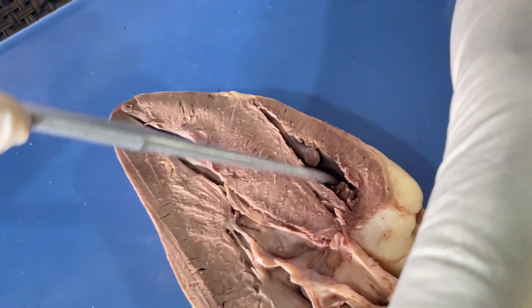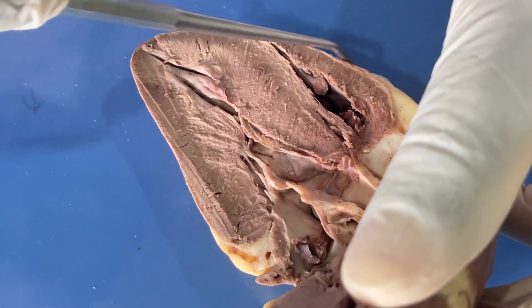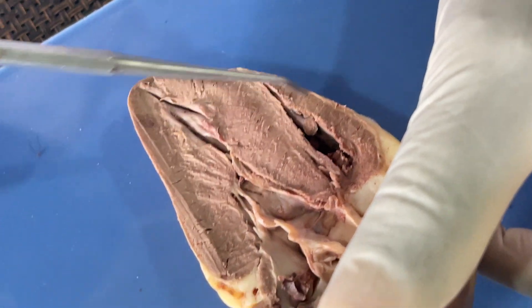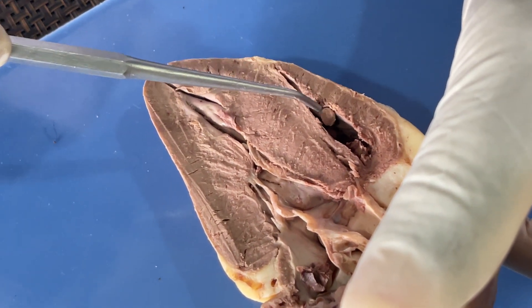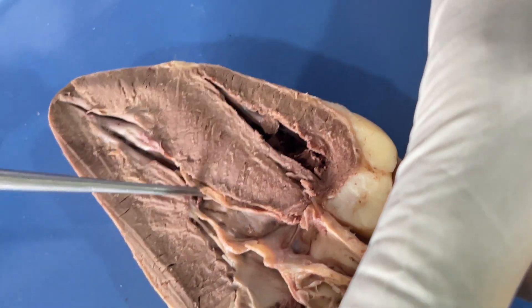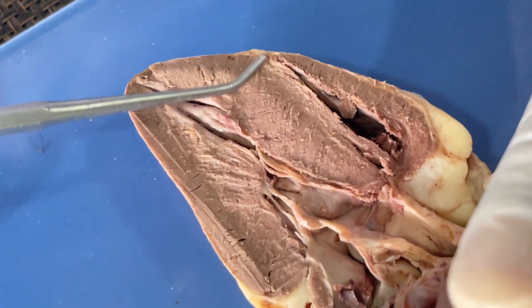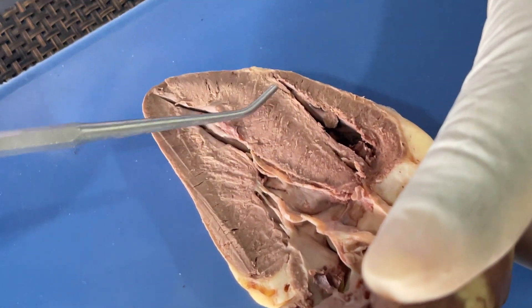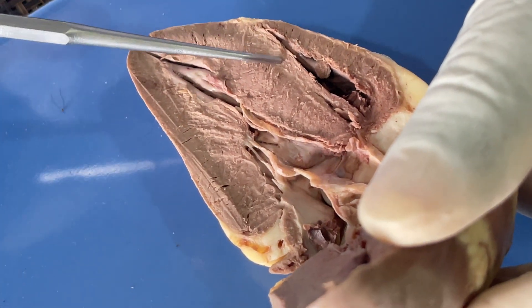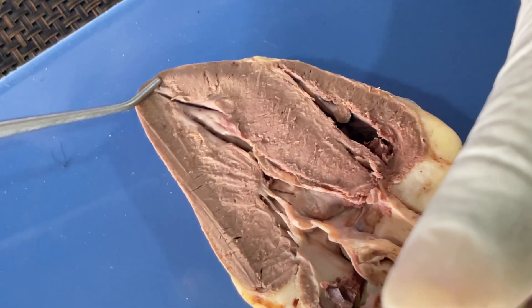We have the trabecula carneae, then we have the walls of the right ventricle. The walls of the right ventricle — we have the external one which is the epicardium, the thin layer there; then we have the myocardium; and inside we have the endocardium. Then we have this septum — this is the interventricular septum, which separates the right ventricle from the left ventricle, and it is made up of the myocardium.